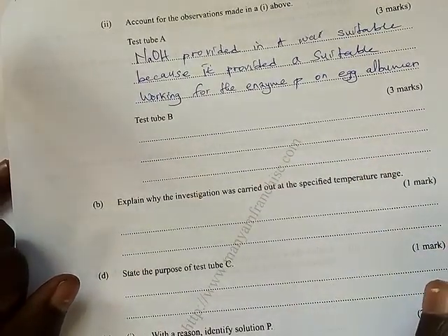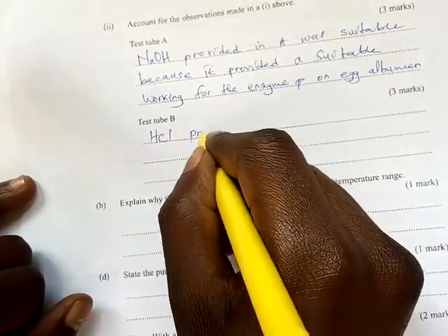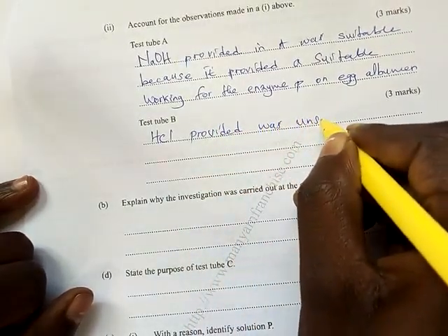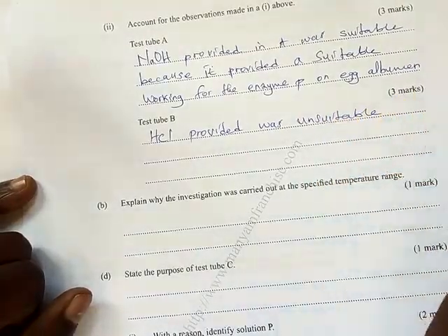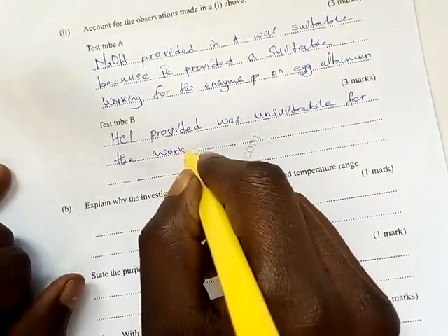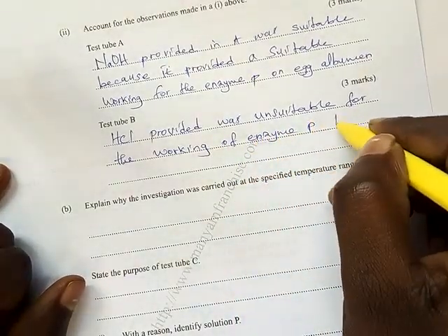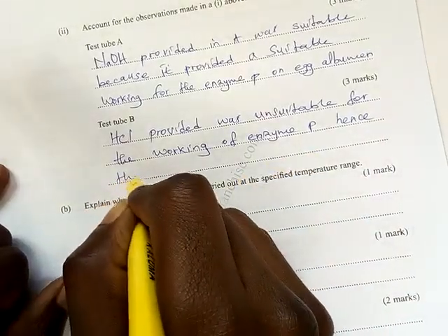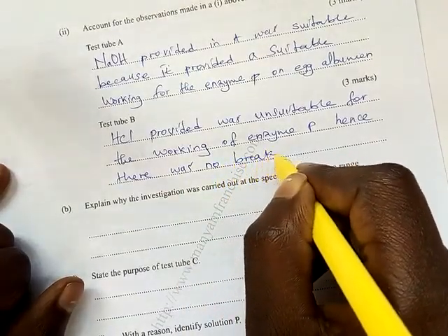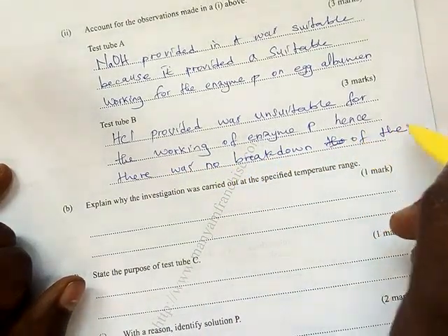In test tube B, we added HCl. HCl provided was unsuitable for the working of enzyme P. Hence there was no digestion or breakdown of the egg albumin.